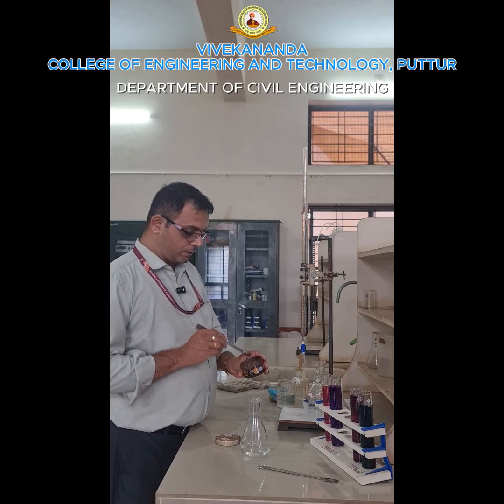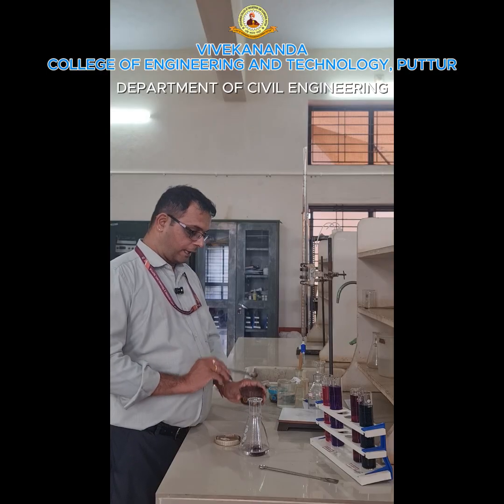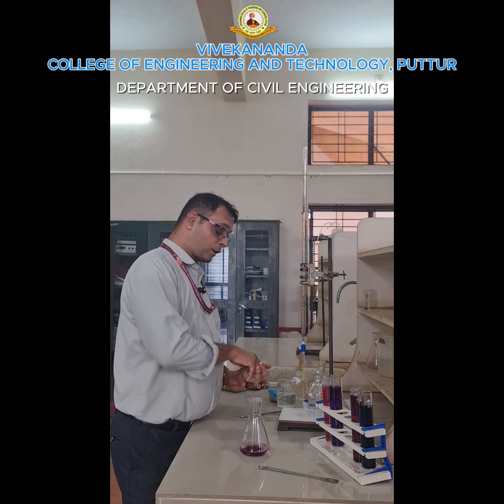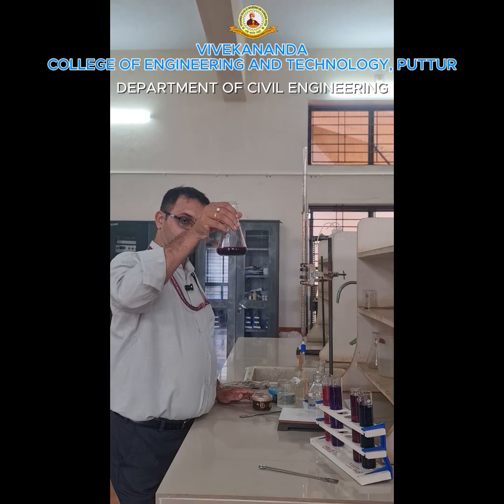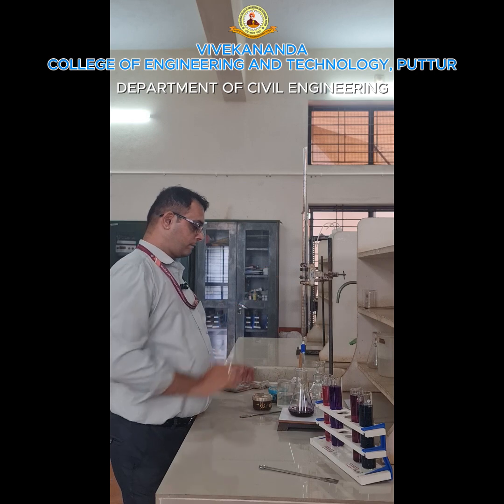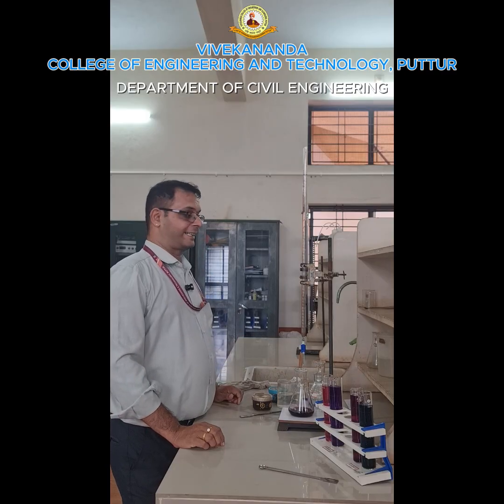The indicator which is used here is Eriochrome Black T. It is a salt. So I am adding Eriochrome Black T, sorry, EBT. Now you can see the color. Now the color is wine red. Right. In this burette, I have taken 0.01 molar EDTA, ethylenediaminetetraacetic acid.